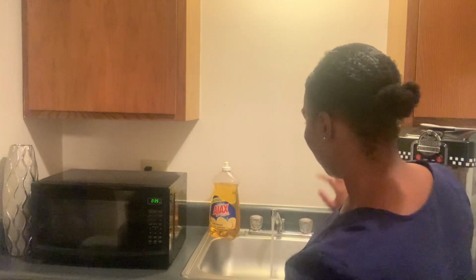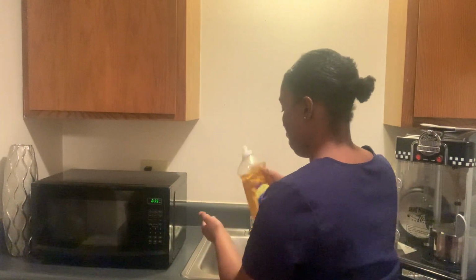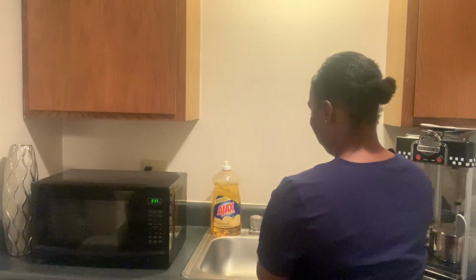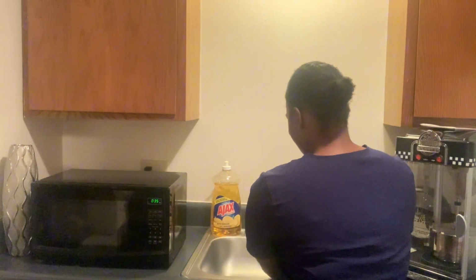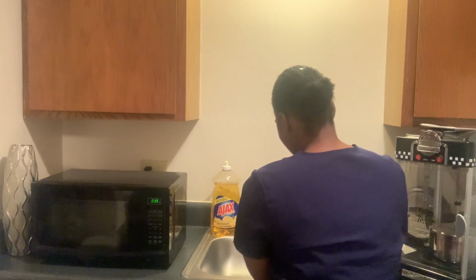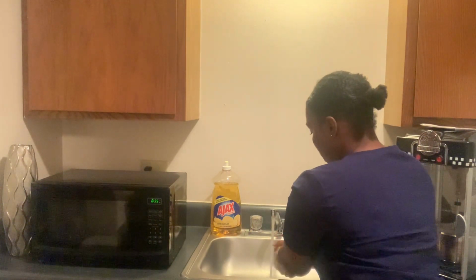Make sure your arms are not hitting the sink or anything like that. So I'm washing my hands.